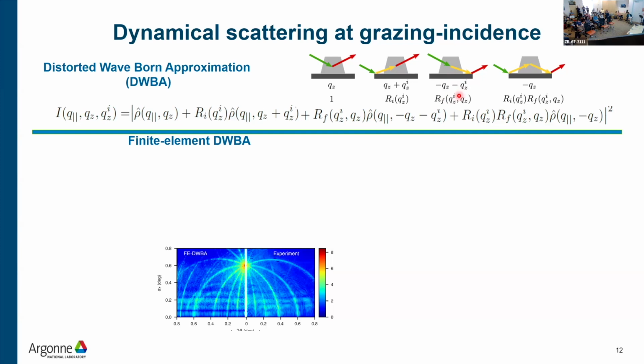So there are a lot of things you can play with in an experiment because you can change the incident angle. You can go high incident angle, low exit angle; low incident angle, high exit angle; both low; or both high. The ptychography CDI I introduced before is basically the first case, where both angles are high, because at that time we didn't know how to do reconstruction with the dynamical effect. Even now we don't have a complete solution, but we are closer.